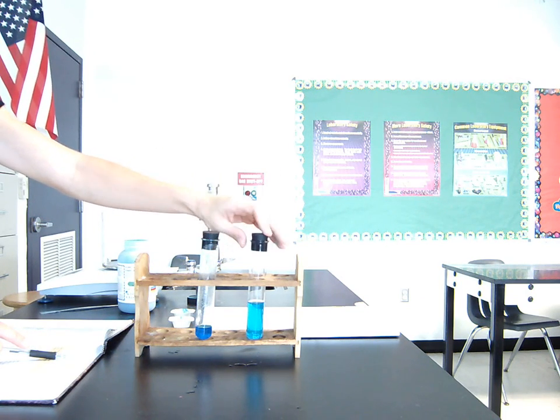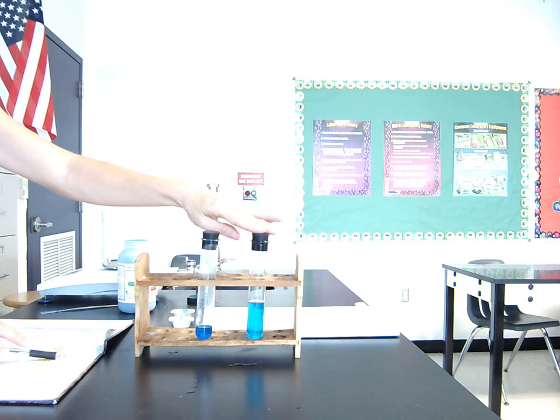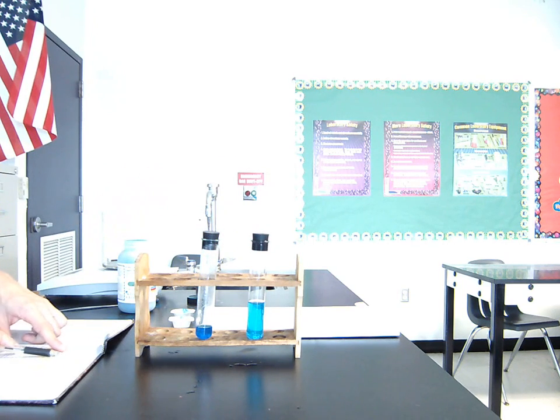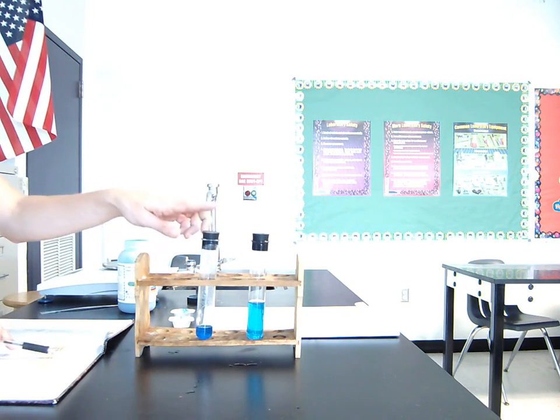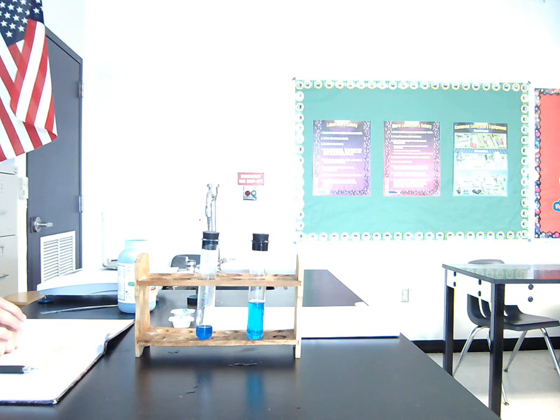This one, everything's dissolved, so I'd have to keep adding more and more to get to the point where no more dissolves. And we determined that's probably somewhere between 1.2 grams and 1.8 grams. So the last blue dot says, do you have a saturated solution in either test tube? Yes, the 5 cubic centimeter solution. What is your evidence? The evidence is that I can see blue solid left undissolved in the bottom of the test tube. So that is lab 1.4.